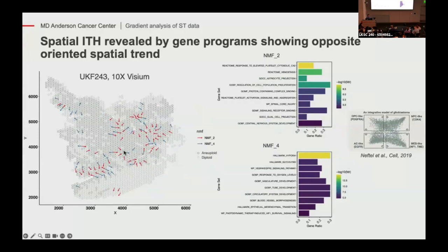So, as you can see here, we already find there's a sharp boundary between those two programs, right at the end of those intersections. So this is reminiscent of what the granuloma talk, given yesterday, showed, even though this is cancer tissue. You can see there's a sharp switch from one program to other programs. And our program is able to give you some indication of where they are and how they are distributed in the tumor tissue.